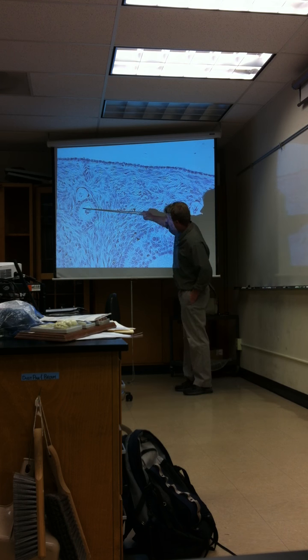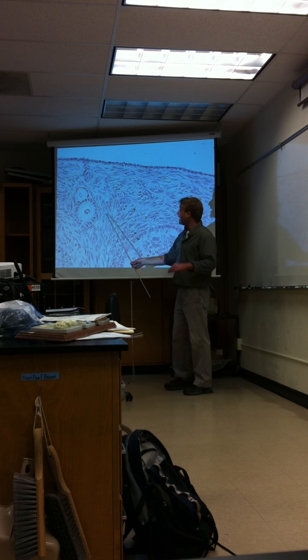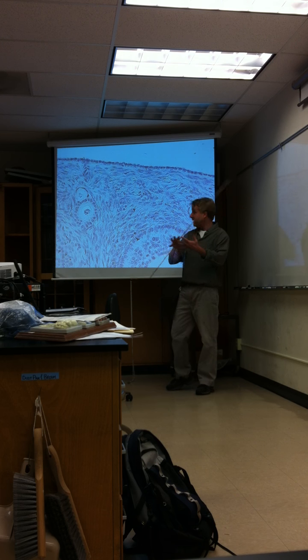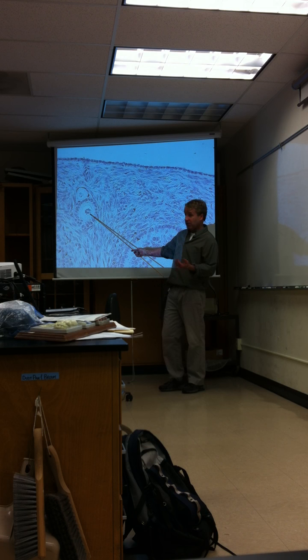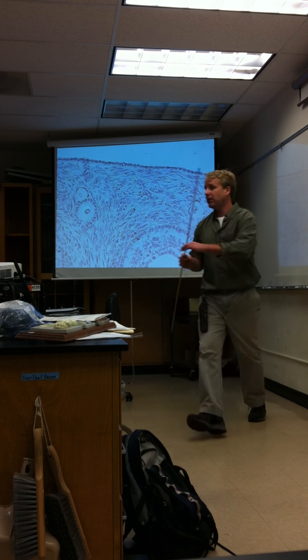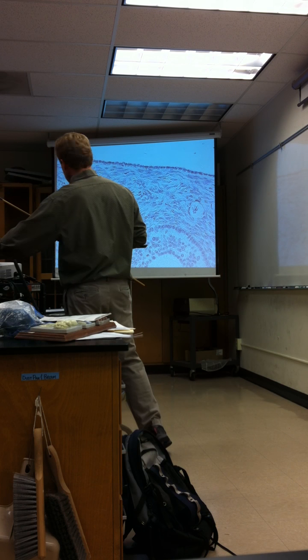This is the nucleus. And what specific phase is it paused in? Prophase 1. Remember, prophase 1 is where you'd actually have chromosomes, and they would be crossing over and kind of connected. So you actually see the chromosomes right there. These are the chromosomes that could be crossing over right here in prophase 1. And so we have right there the one view, and that's kind of the first picture I drew.